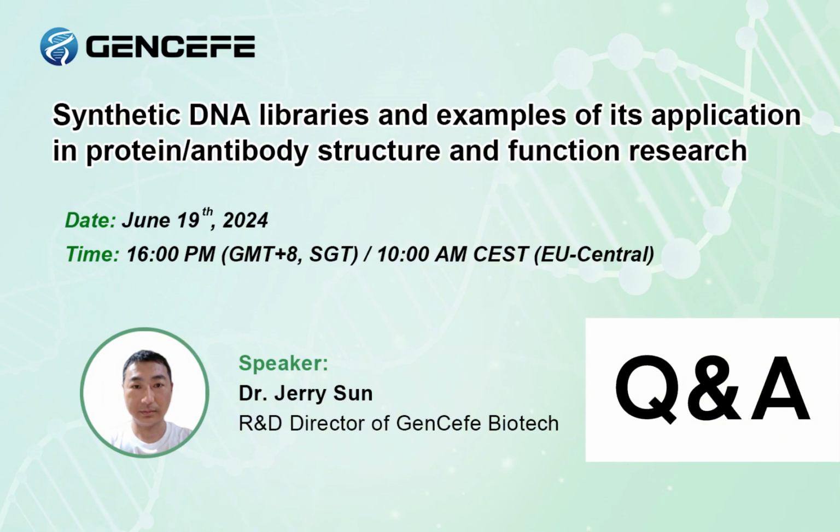You mean you don't have the antigen? No, actually, for example, if you don't have any wild type gene, still you would like to screen. So you can make random mutations in huge numbers, and then you can screen. So do you provide that kind of library? You mean a fully synthetic protein library, correct? Yes, exactly, fully synthetic. So you don't have a wild type antibody, and you want to design one. Is that correct? Yes, exactly.